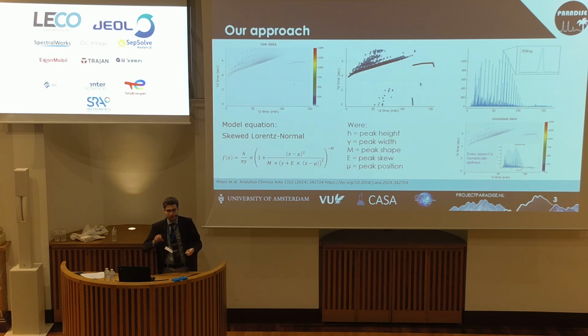And if you want, you could even start tweaking these peaks. So if you want to increase one peak a little bit more or decrease it a little bit, you can completely play around. And this allows you to use it as a sort of standard, like we've been doing for many years with chemical standards in the lab, but now as a standard for your data analysis.